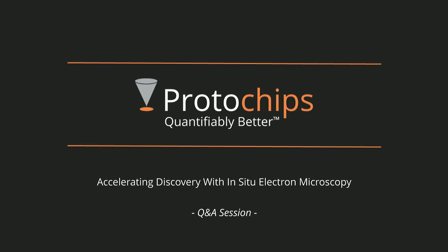Jordan, maybe I can field that question. There's been a big initiative on how we can use electron beams to manipulate matter down to the fundamental length scale, or the atomic structure. And this is definitely not a mass production type process, but more using the electron beam to understand the basic mechanisms of how and why these materials rearrange themselves from a basic level.